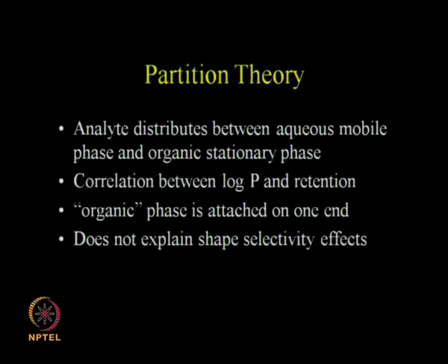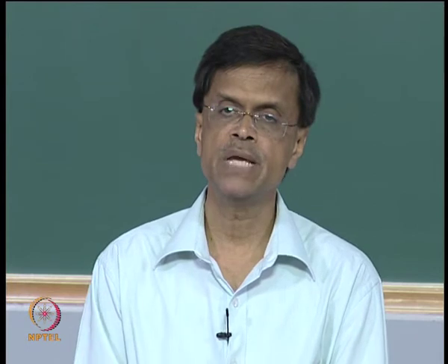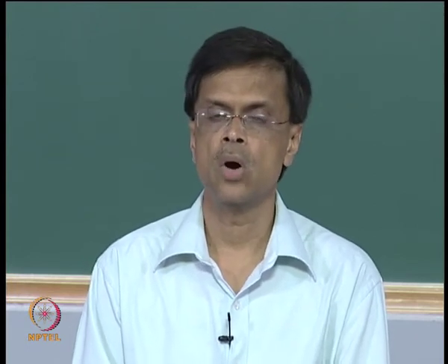Now the retention of these analytes in the column is correlated to the log P. Log P is nothing but the logarithm of the partition of an analyte between octanol and water. Octanol is considered to be hydrophobic and water is considered to be hydrophilic.